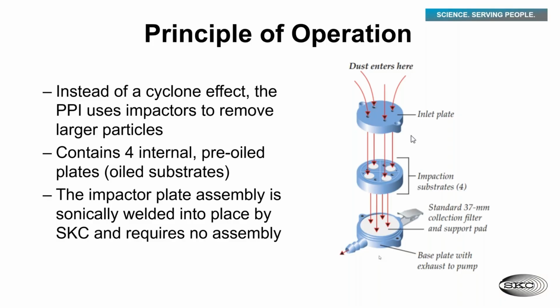They cover the ends, send it to the lab, and that's it. It's a little bit simpler, a little bit easier to do. If you're doing a lot of samples from a research point of view, being able to load your own samples is a little more cost effective. And so going with something that's reusable is beneficial for something like that.